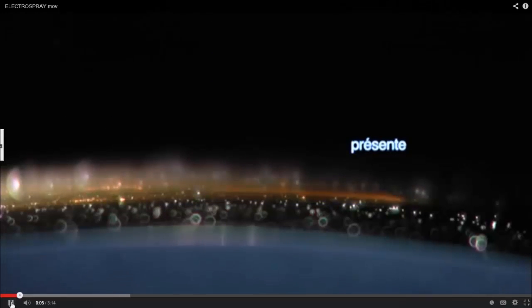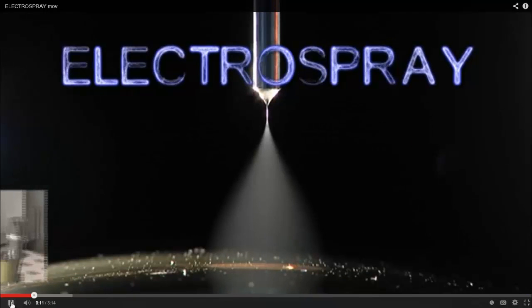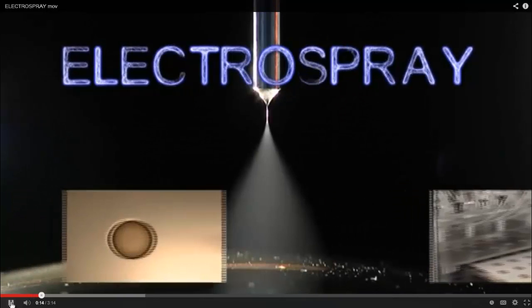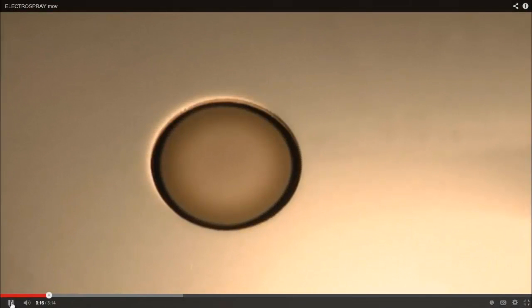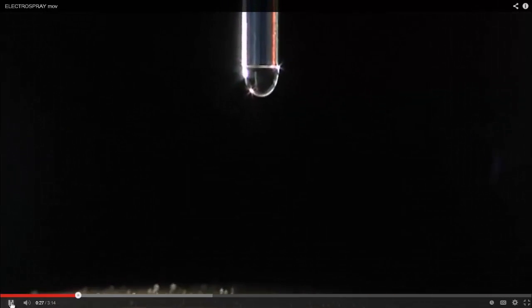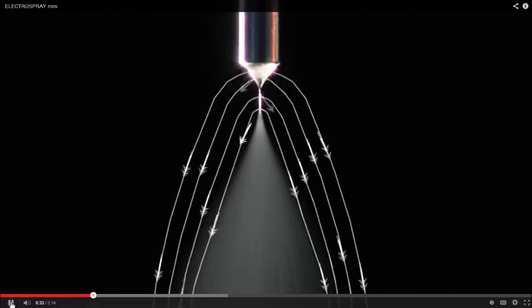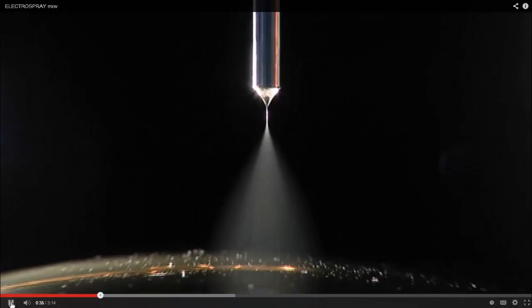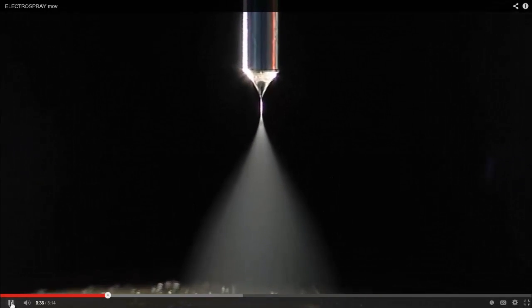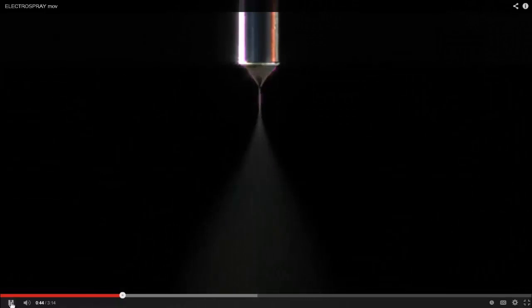Have you ever heard of electrospray? This aerosol technique has many existing and potential applications, and among them is the making of dry and fine deposits of substance. Electrospray starts with a liquid formulation, pushed through a capillary at a precise and constant flow. When an electric field is created by wiring the liquid to a high voltage, the meniscus rapidly turns into a stable cone, out of which a jet of liquid emerges and becomes a stable spray. This is the cone jet mode.